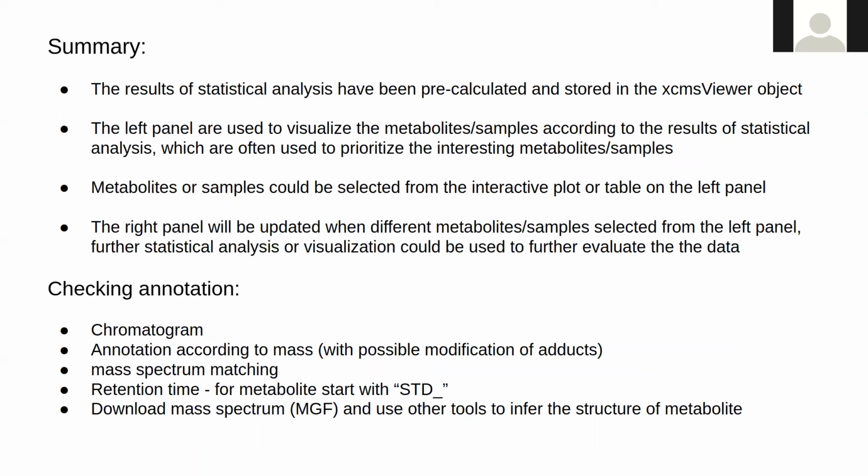Those selected samples and metabolites will be passed to the right panel. Some statistical analysis will be calculated based on the samples and metabolites you selected. And the result will be organized, for example, in figures, plots, or tables. You can quickly check results and develop your hypothesis or try to confirm your hypothesis. That's how the xcmsViewer is developed.